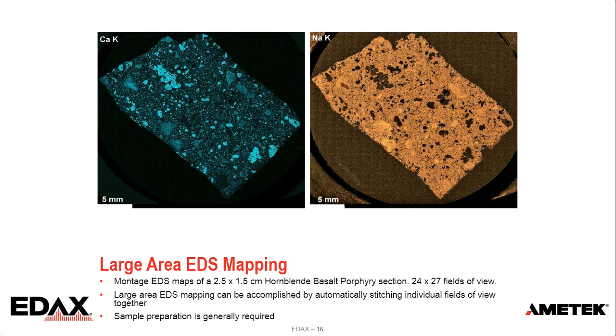It consists of 24 by 27 fields of view. But for this kind of application in EDS, generally sample preparation is required. In this case, we need to polish the section, and we also have to coat the section to make it conductive to be analyzed in EDS.